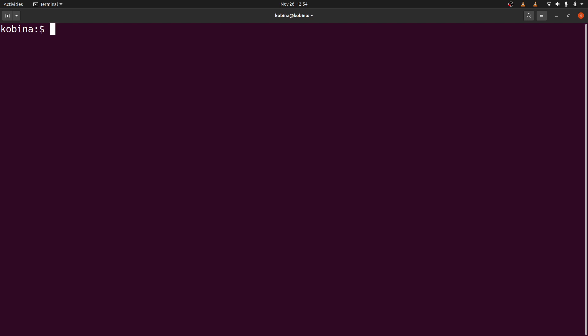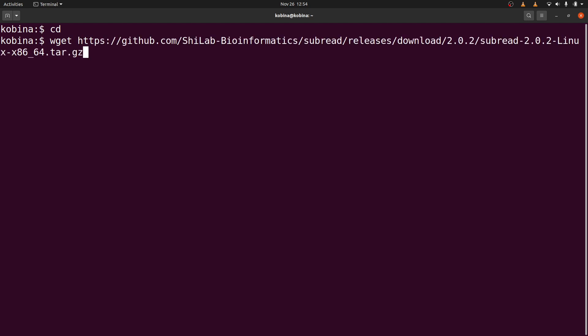So on the terminal, I'll first cd to my home directory. Then I'll use wget to download the binaries, so I'll say wget and then I'll supply it with a link. So this is a tar file, so I'll execute this command to download it.